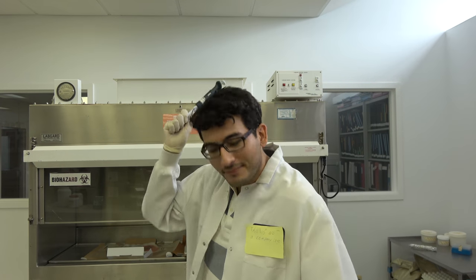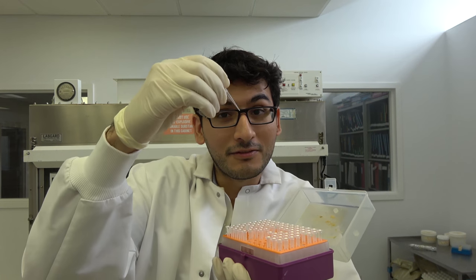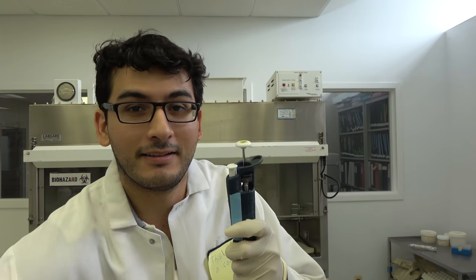So I went online for a quick second, just to make sure, and they actually call these micropipettes, which doesn't make fucking sense, okay? I like to say when something's a pipette, it's the thing that holds the liquid. You know, this would be a micropipette, because it fits a micropipetter. And the pipetter is the thing doing the pipetting. Because that makes fucking sense, right? But fuck. For purposes of angry scientists, I will always be referring to this as a micropipetter. It's my video. My fucking rules. Suck it.